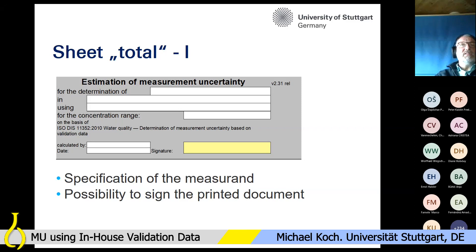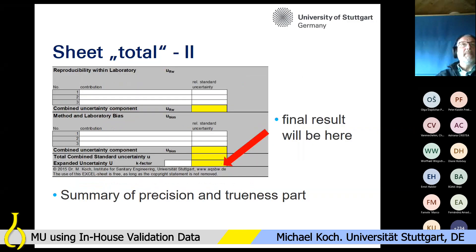The sheet 'Total' gives the specification of the measurement and, after finalizing everything, provides the possibility to sign the printed documents. In the lower part of the sheet, this is the result of reproducibility within the laboratory, and this part covers the bias. Here you will see the total combined standard uncertainty and finally the expanded uncertainty using the k factor that you can enter.